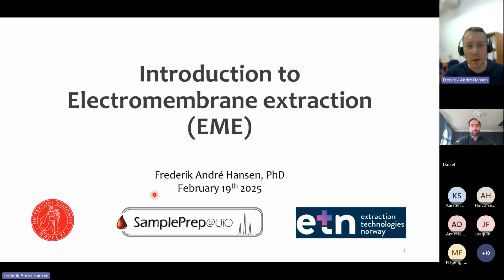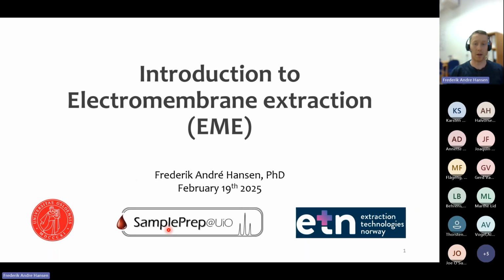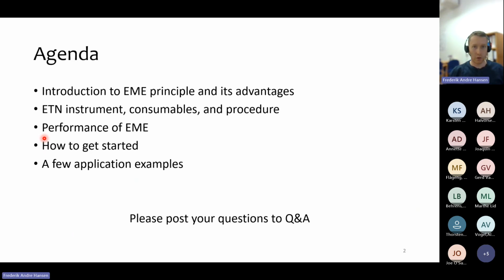Thank you, Daniel. I hope you can all see my screen. Short introduction to me. My name is Fredrik André Hansen, and I am a postdoctoral researcher at the University of Oslo in the group called Sample Prep at UIO. Here we do research that is very focused on electromembrane extraction. Over the years, we have built up a big portfolio of knowledge and results. For these first 30 minutes, I will give you an introduction to the EME principle and its advantages. We will cover the ETN instrument, consumables, and procedure, a bit about what kind of performance you get for EME, how you can get started, and then I have a few application examples. If you have any questions, as Daniel mentioned, please just post them in the Q&A section.